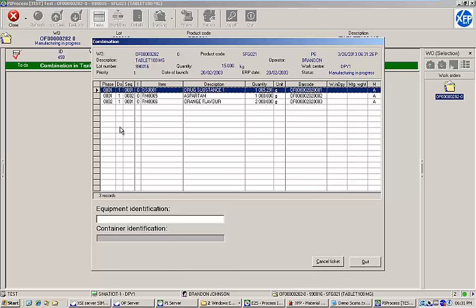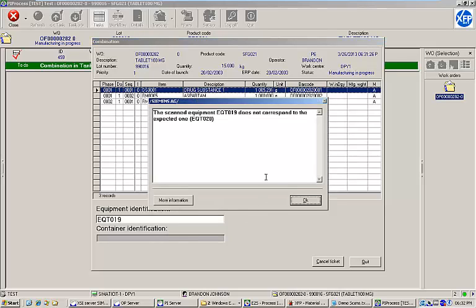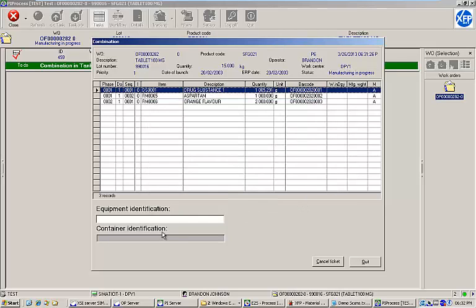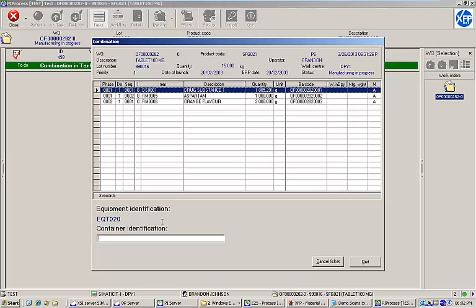Earlier, we identified tank EQT020 as our compounding tank and moved it to the manufacturing location. If I try to identify a different tank at this point in the process, the EBR will generate an error and will not let me proceed. Once I've identified the correct tank, I will scan each of the materials that I weighed in the first step of the EBR. After each material, I'm prompted to provide an electronic signature.